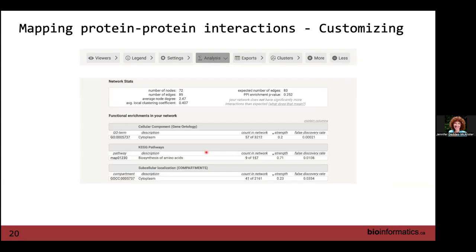Within the analysis tab, all information is based on the network displayed. It can bring in gene ontology information. If your genes have annotation, it can give you information on where they're located or predicted to be located, different KEGG pathways — people have asked about proteins, metabolites, and pathways, and String can give you insight into that.